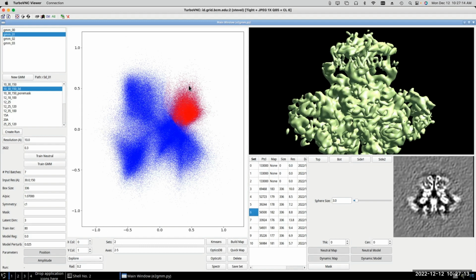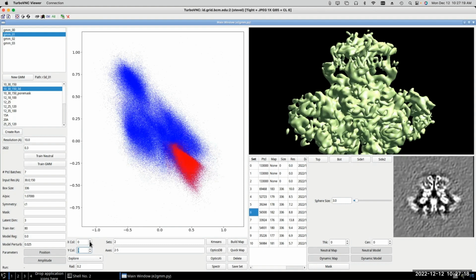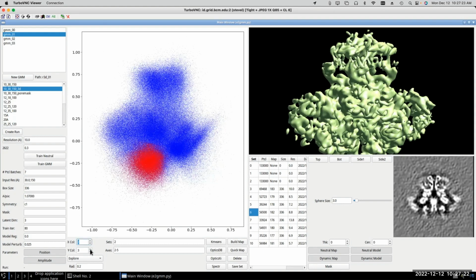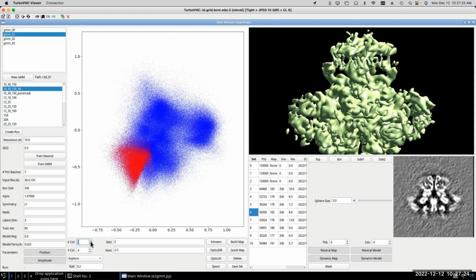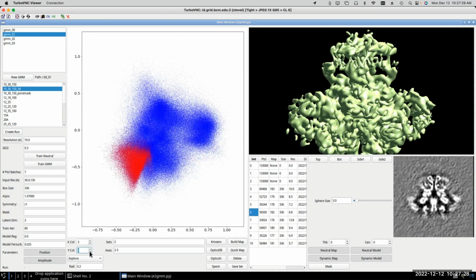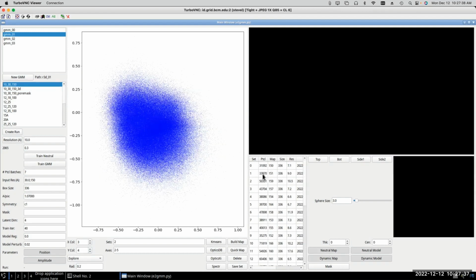So if I look at these classes like this here, and if I look at that in a different projection orientation, it may not look nearly as, well, apparently this one does. Some of them won't look nearly as isolated in space anymore. Let me try a four-dimensional space and see what I get with one of those. Always seems to happen, right?